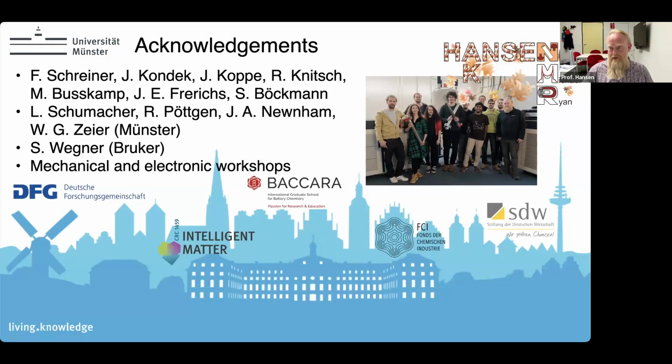This is difficult. What's much easier, this is also what I did during my PhD, in fact, and what's being pursued in other groups, is to use quadrupolar nuclei as spy nuclei in a structure, for instance, pharmaceutical structures. And there it works much better because it's much lighter quadrupolar nuclei, like chlorine or other elements. It works well, I would say. So again, DFT is not easy, and sometimes you need help from the experts, I would say.